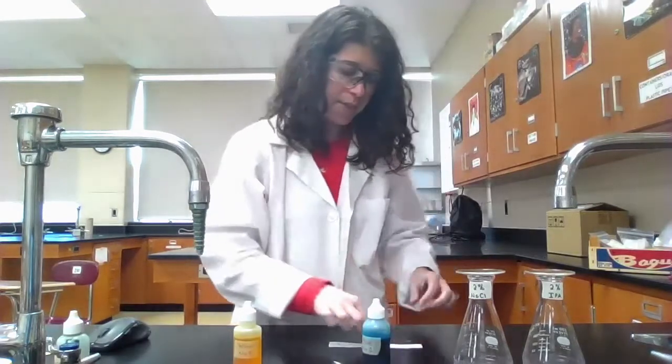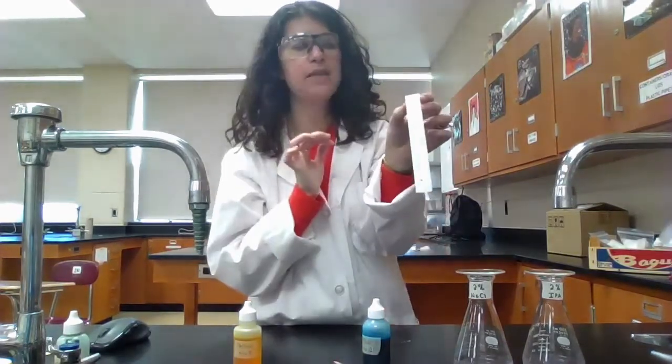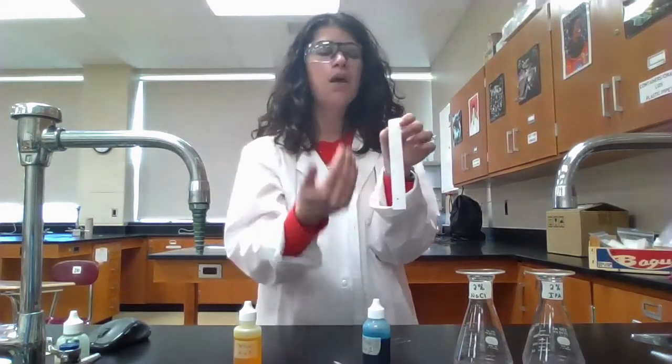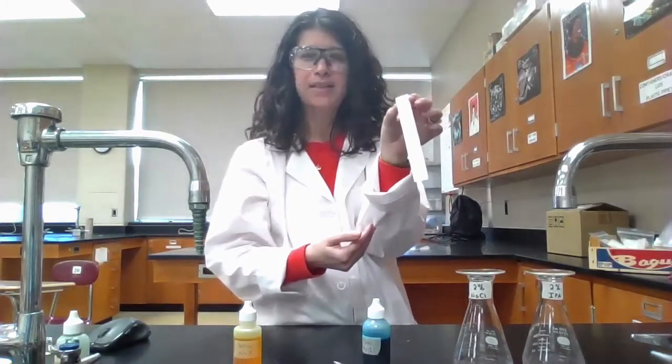I'm holding the paper on its edges. I'm trying not to touch the surface because I don't want any oil or dirt from my fingers to contaminate the chromatography paper.